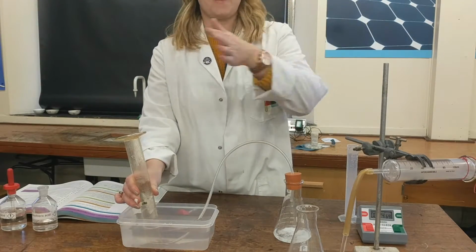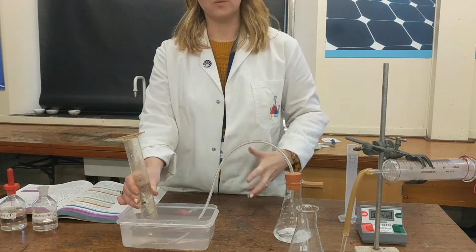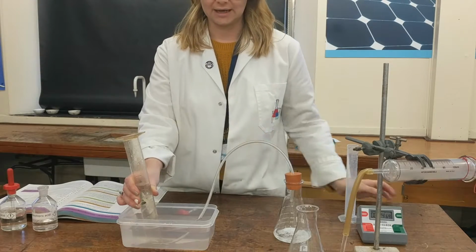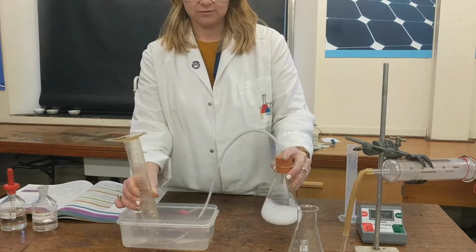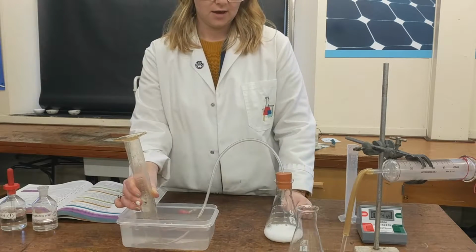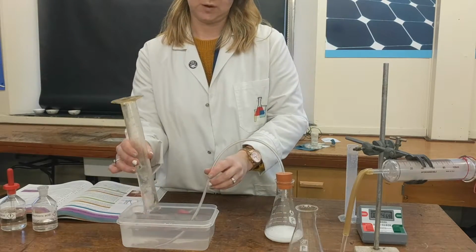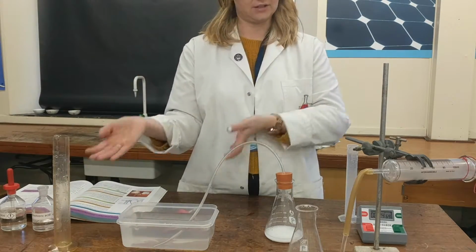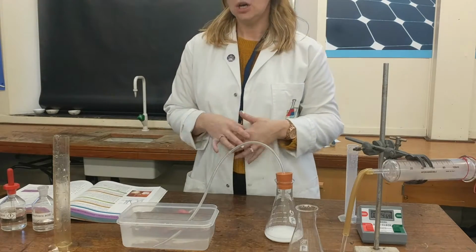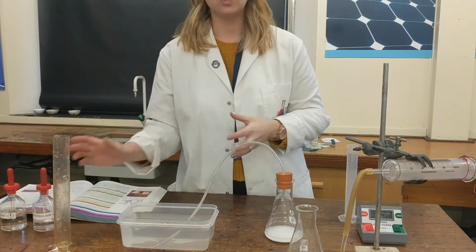And then you would compare the two. The steeper the curve from your results, the more gas that's produced the most quickly, the faster the reaction is. You could stir the reaction to make it happen a bit quicker, but if you stir for this one, you've got to make sure that you stir for the chips as well. Okay, so that's two methods. Now in the exam they might talk to you about one method and ask you for an alternative method, so it's really important that you've seen how both of these work. Remember, for rates of reaction, it's all about the rate of successful collisions.